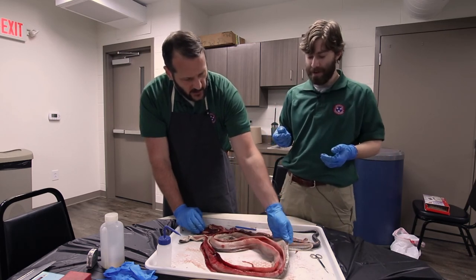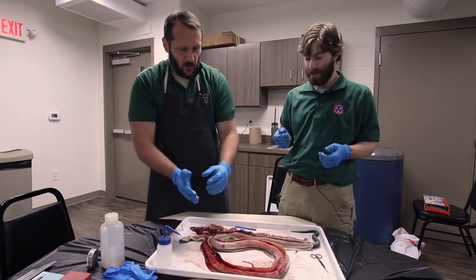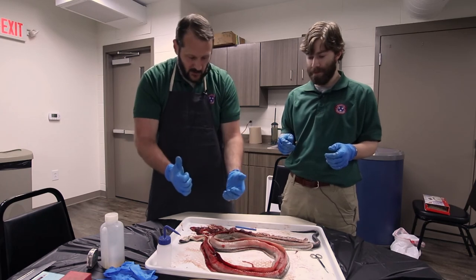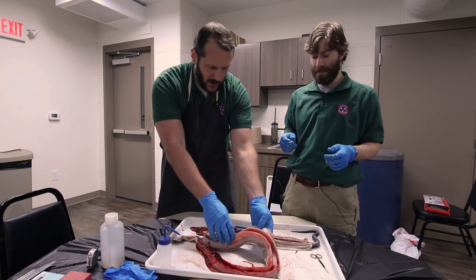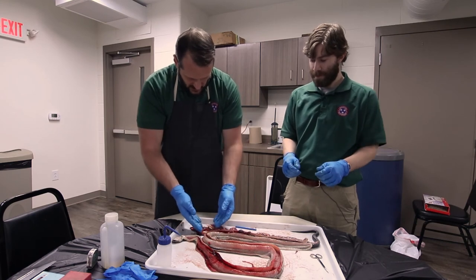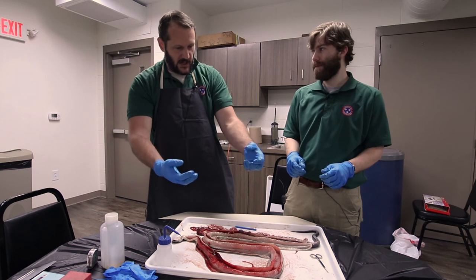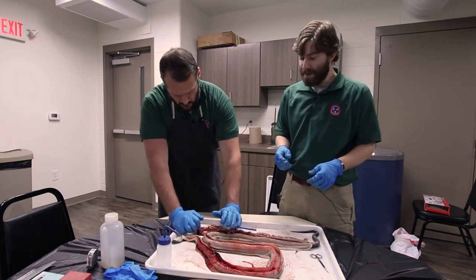Terrific. So it's helpful for research institutions like the Nature Center to have what's called a comparative collection. And for us, Lance and I are both students of bones primarily, skeletal anatomy. And so to take this snake, which is muscle and skin and guts, and turn this into a nice collection of bones, how do we do that? There's a couple different ways.